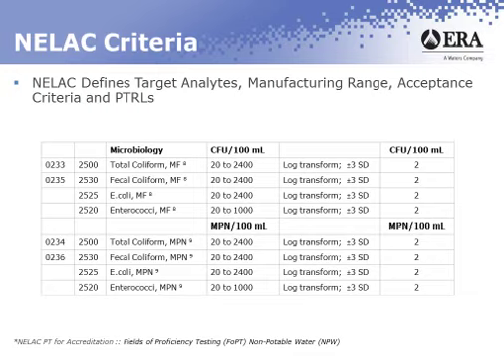The one on this particular screen is for the non-potable water table, which covers primarily wastewater. These are posted on TNI's website. They're available for everyone to look at. The origin of these tables: they've been put together by committees that were formed by TNI.